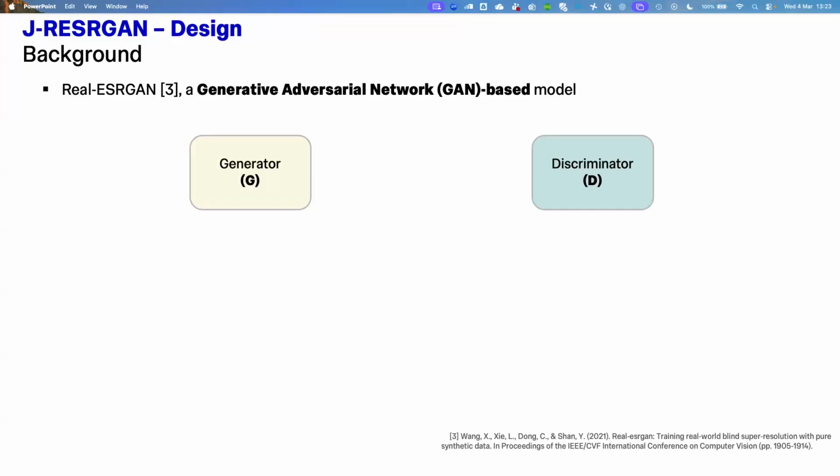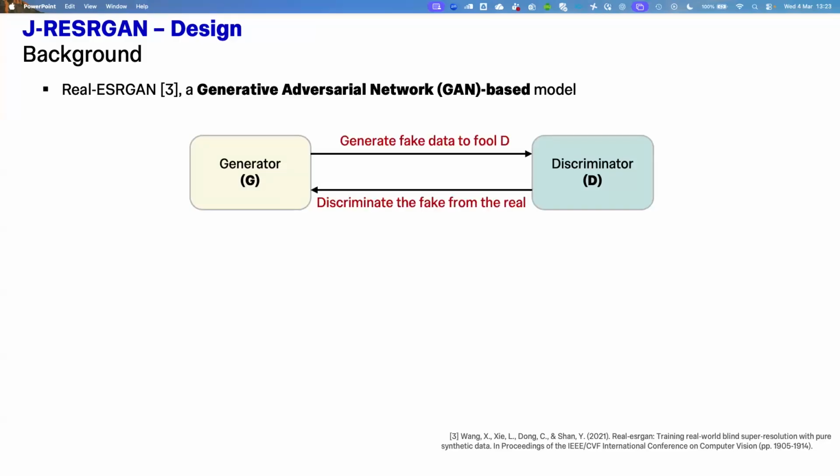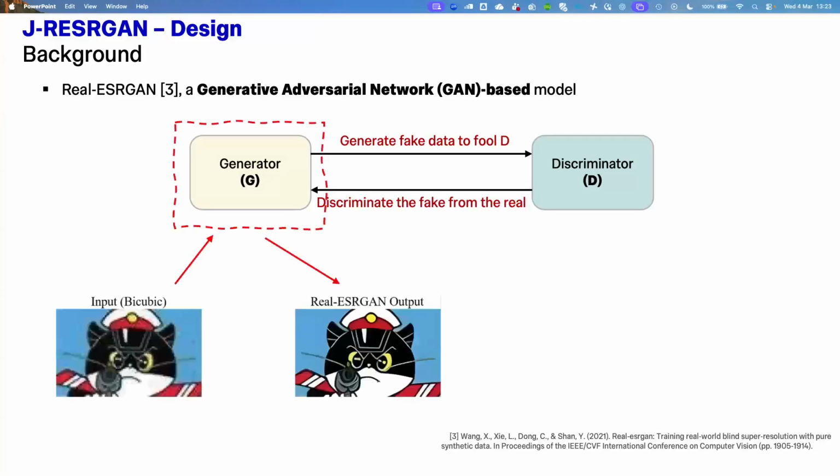There's a network already out there called Real-ESRGAN. Okay, so it's a generative adversarial network for enhanced spatial resolution. It has these two parts, the generator and discriminator, which work together, as I've already explained. And if we have images, once it's trained, we can input a low resolution image and we can output, hopefully, a higher resolution image where everything's more clear.